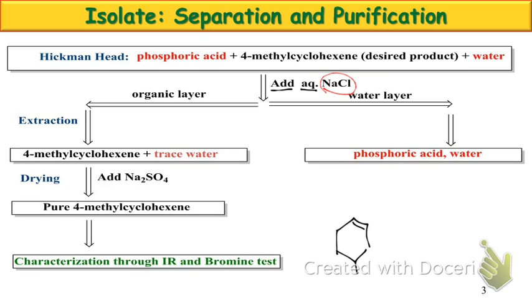What happens in our second step? We add even more salt. Our salt concentration is even higher in this case because we're adding it as a solid. So it can remove the last remaining dregs of water out of our solution. We'll now have our solid sodium sulfate salt trapping water with our liquid product around the outside. How do we separate those two? We could do a filtration, or we could do just decanting, something simple.